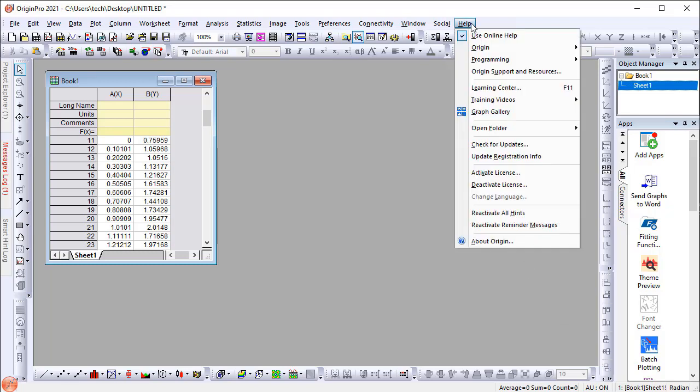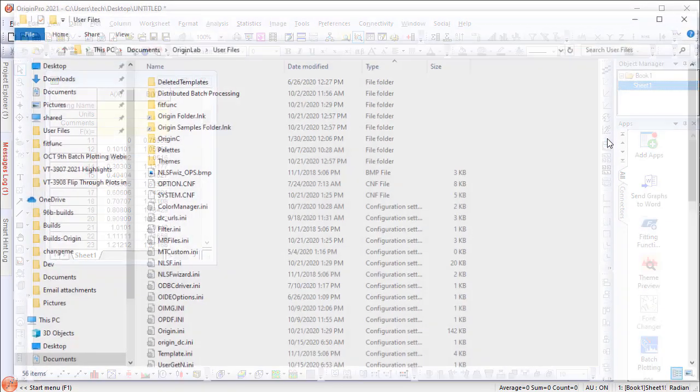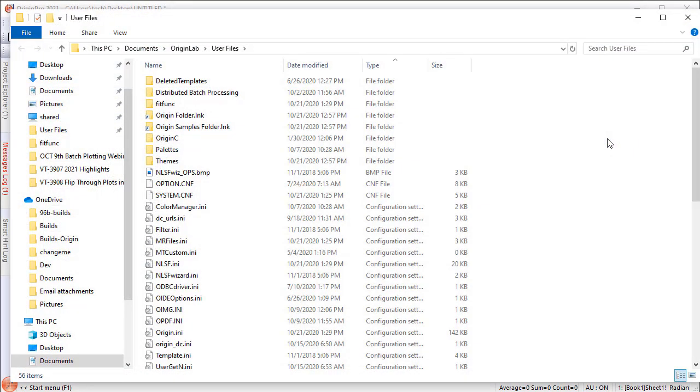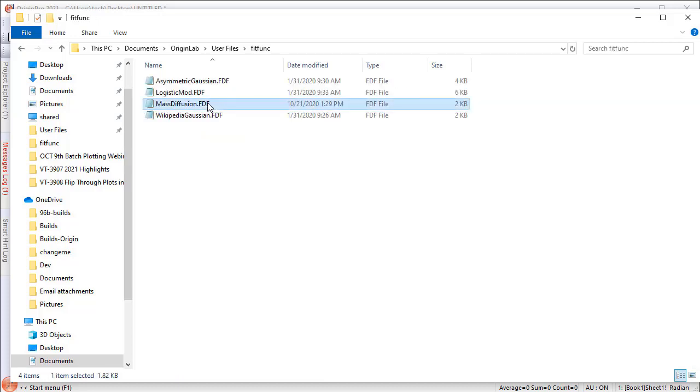Go to the Help menu and open the User Files folder, then open the Fit Function subfolder. Find the fitting function file and open it in any text editor, such as Notepad.